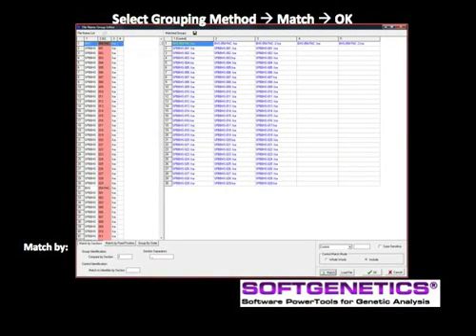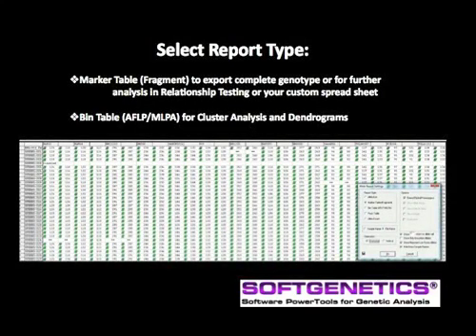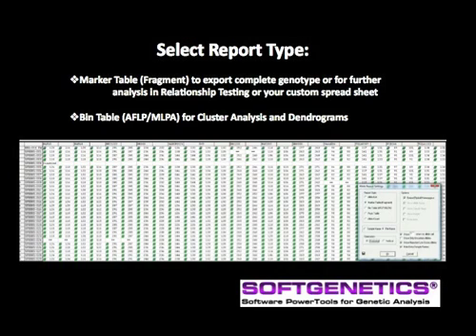Use the grouping tool icon to combine the results from the three projects. Match samples according to section, fixed position, or order, then click Match and OK. The individual projects had four to six loci per project. The combined genotype now has 13 independently assorting loci for each sample, greatly enhancing the rigor of kinship and clustering analyses.